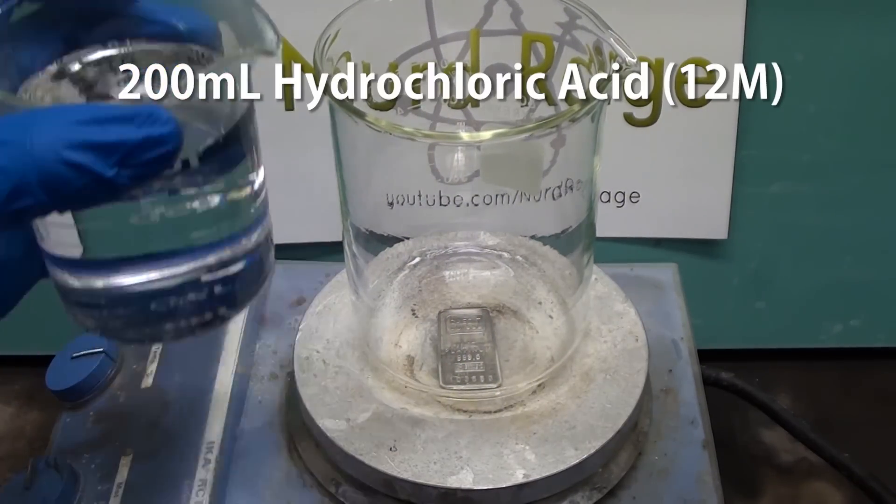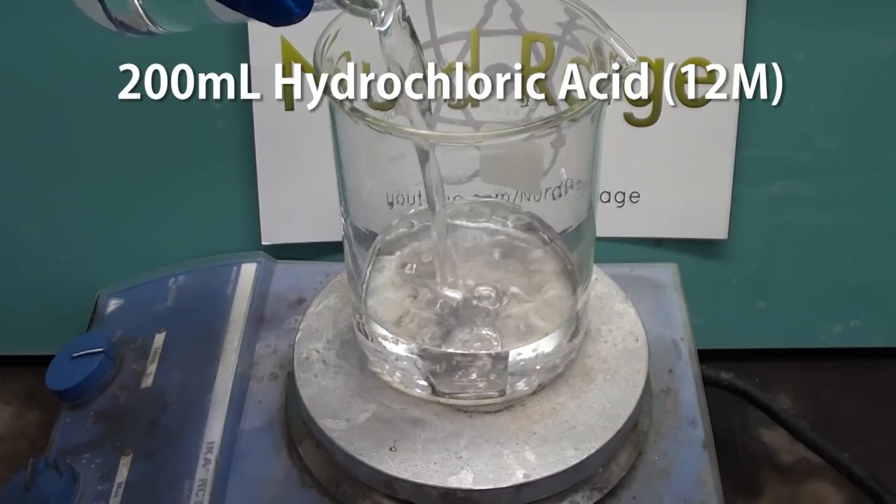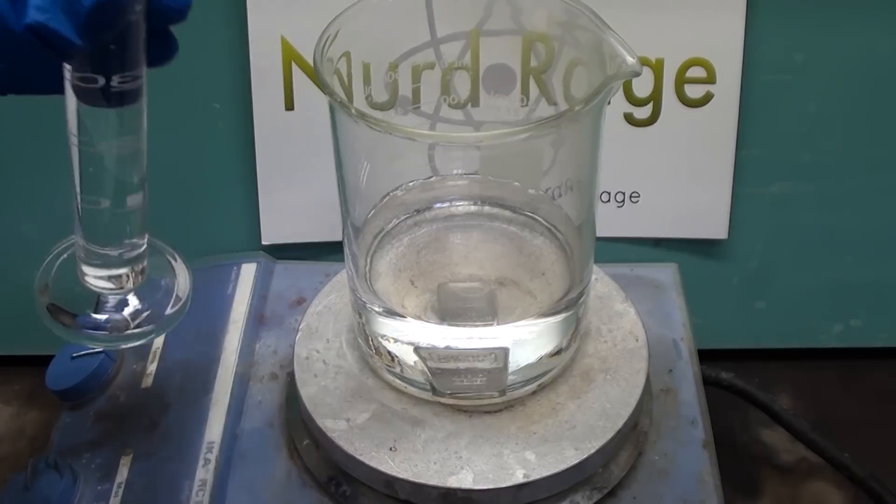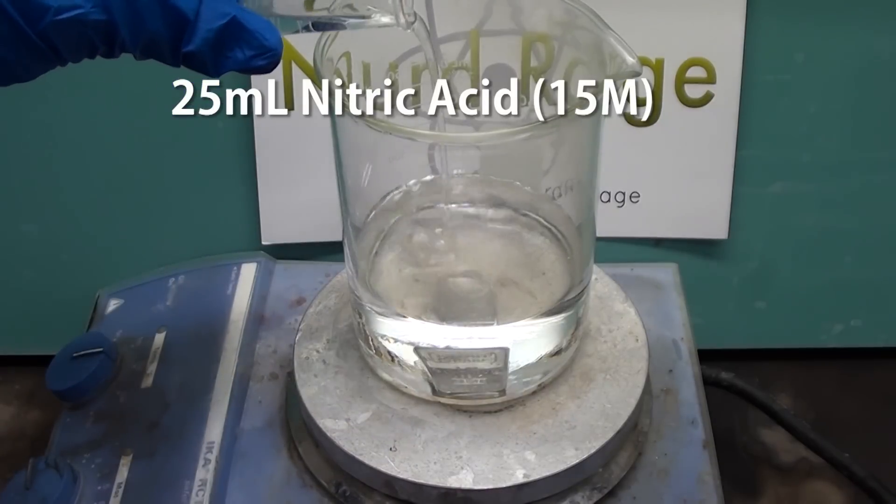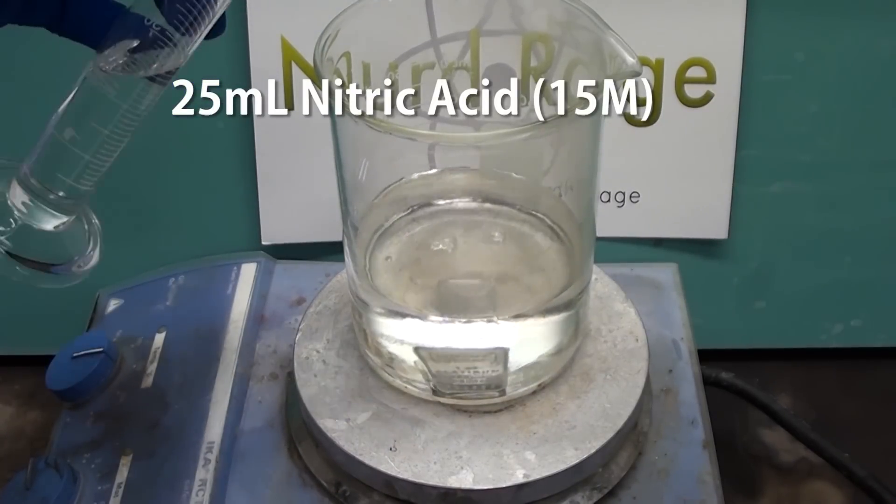Now we add 200 milliliters of concentrated 12 molar hydrochloric acid. To start we'll add 25 milliliters of 15 molar nitric acid, but we'll add more as we need to.